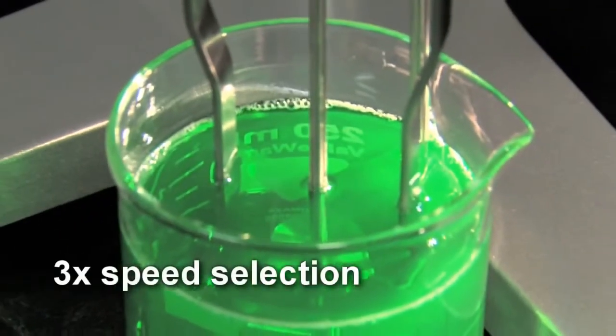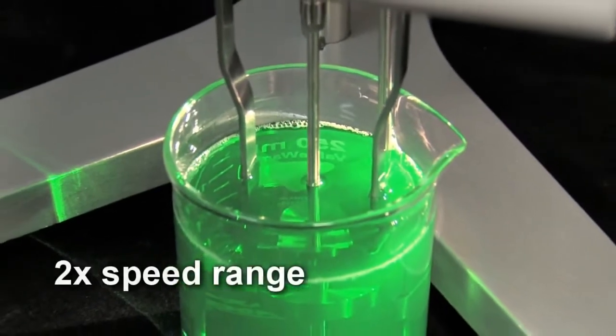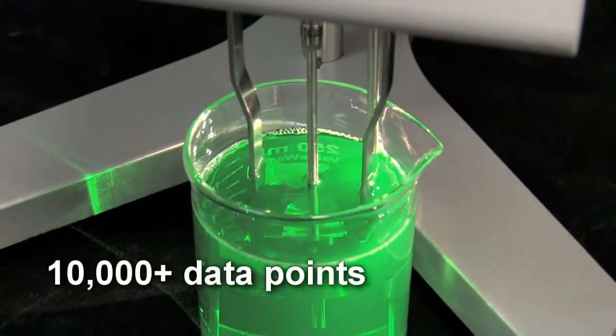The advanced viscometer with temperature probe offers three times the speed selection, double the speed range, and stores more than 10,000 data points.